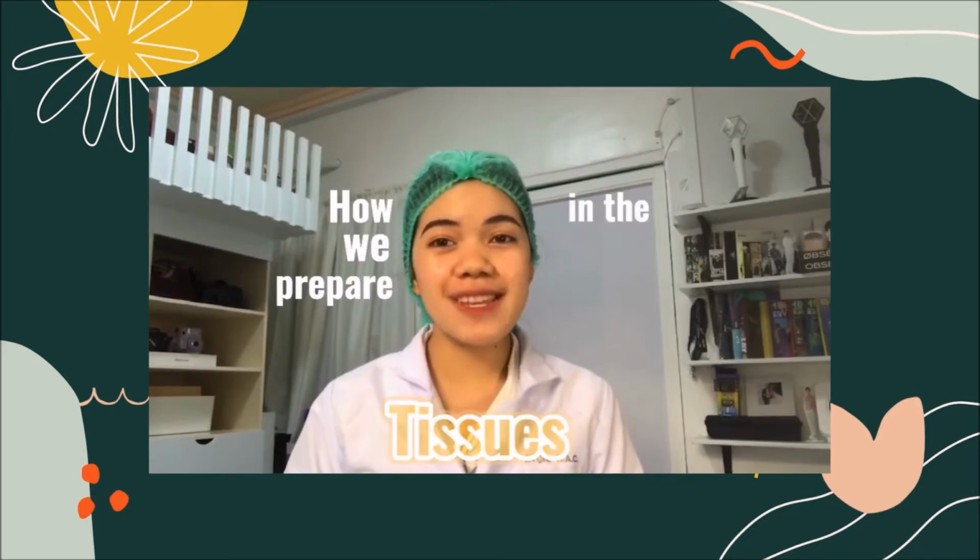And today I'm going to show you how we prepare tissues in the histopathology section of the laboratory. But first, what is tissue processing? So the aim of tissue processing is to embed the tissue in a solid medium frame, enough to support the tissue and give it sufficient rigidity to enable a thin section to be cut, yet soft enough not to damage the knife or the tissue.